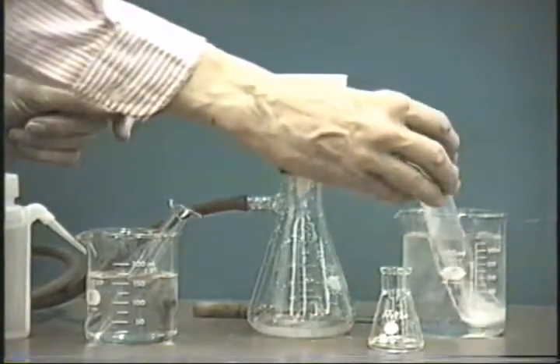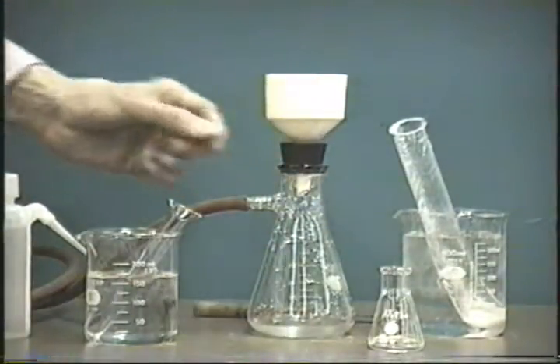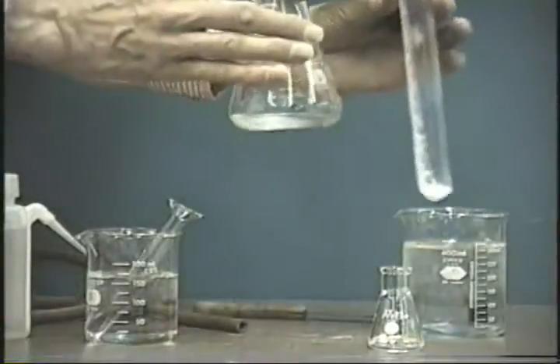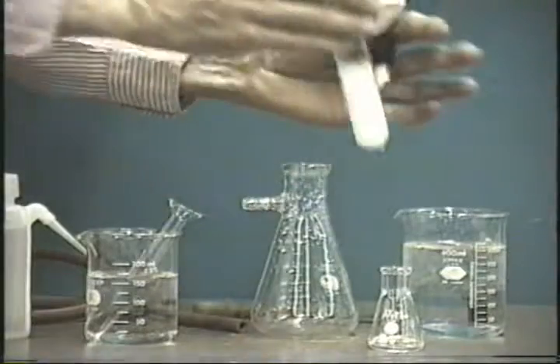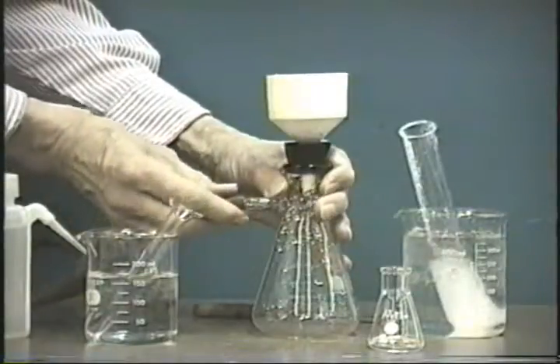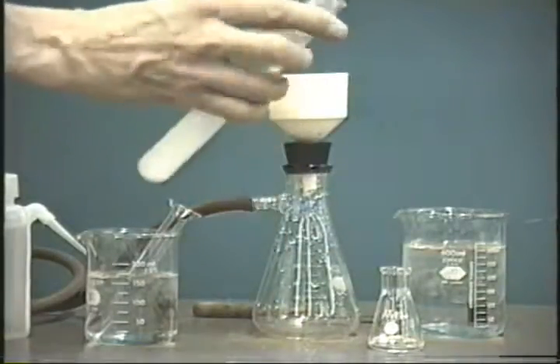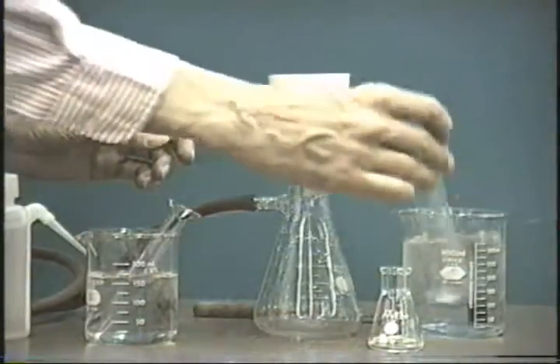Now there's still some left, we'll get rid of that later. And the filtration. What we will do is take the mother liquor here and use that to get the rest of the material out of the tube here. We'll reconnect the vacuum. Mix this up again. There, that's much better.